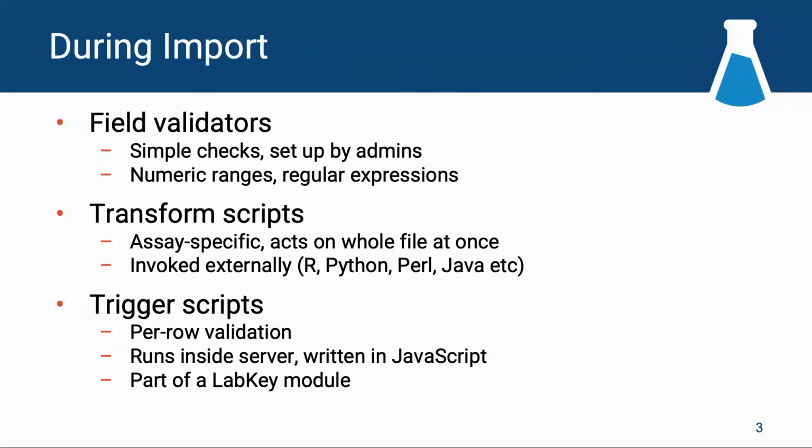One good example that we've been bitten by many times over the years: let's say you have a sample list, and those are linked back to a subject ID, whether that's a human participant in a clinical trial, an animal ID from the Primate Center, or just a cell culture ID. And we ask, do you always have that subject information in the database before you try and import that sample that came from that subject? And the answer is yes, except a couple times.